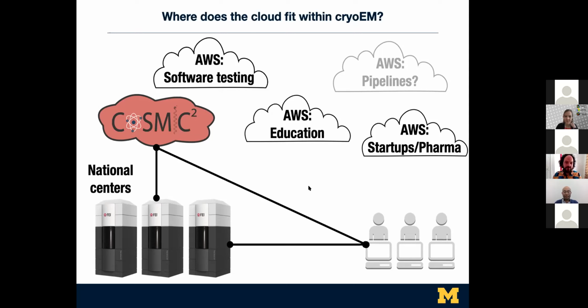There are a couple of questions that I think we can answer in one go about getting your data up into the cloud, because there's a lot of data and transfer speeds can be gating. So how long does it actually take to get your data up into the cloud? Probably a bad example is at Michigan, we have really good internet, and so we get like 300 megabytes per second.